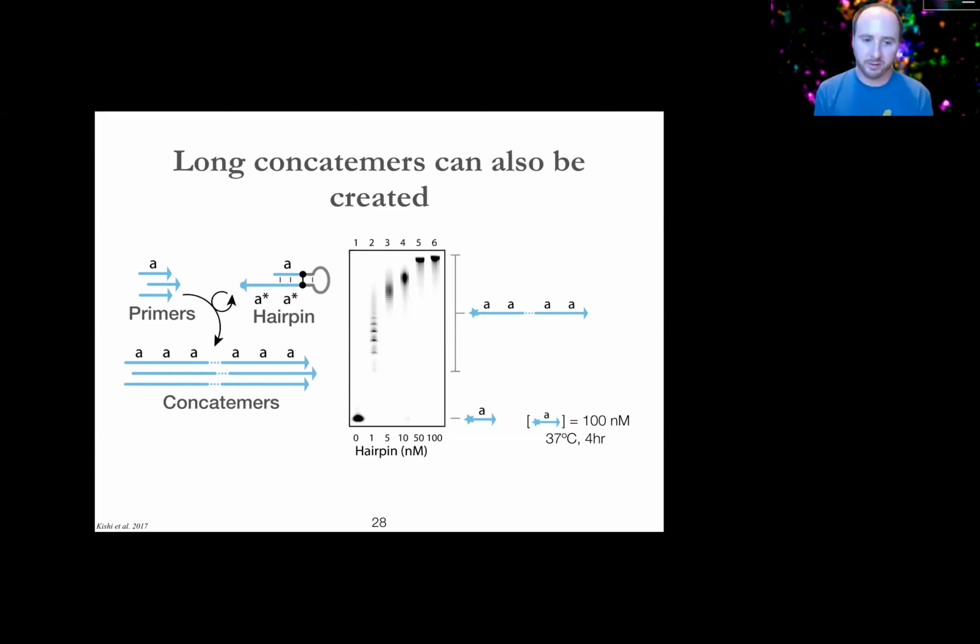So this is a really efficient and cheap reaction to generate potentially kilobases worth of repetitive DNA, the same 9 or 10 bases repeated over and over again. This is very similar to a PCR to set up. It costs about $1 per reaction. It's isothermal at 37, and you run it for 1, 3, or 4 hours.